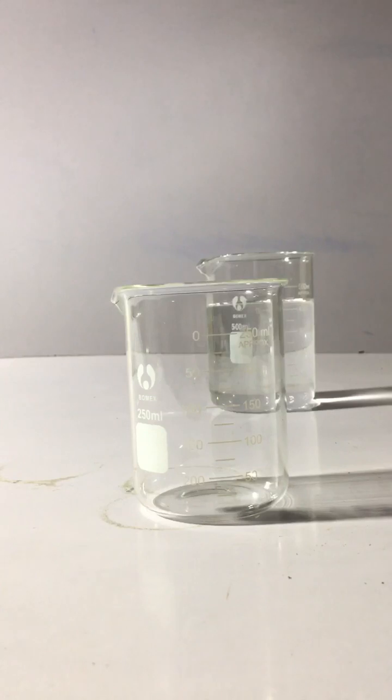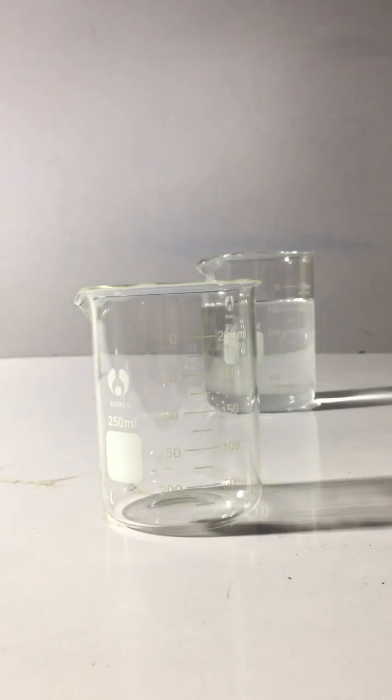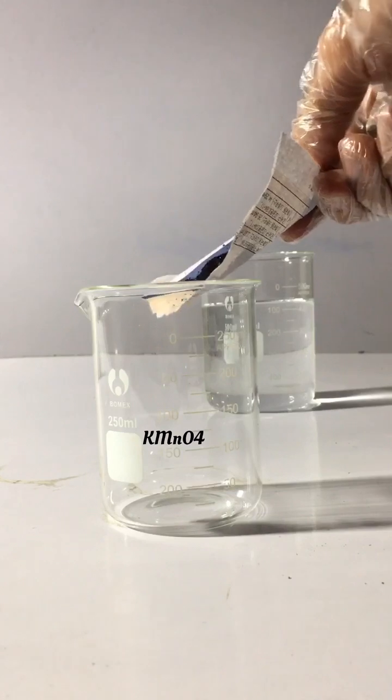Hi everyone, today we will perform an amazing experiment with potassium permanganate and sulfuric acid. First of all, you have to take solid potassium permanganate, as you can see, and put it in the beaker.